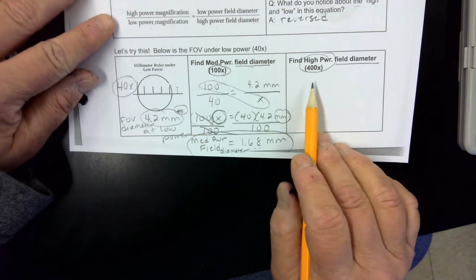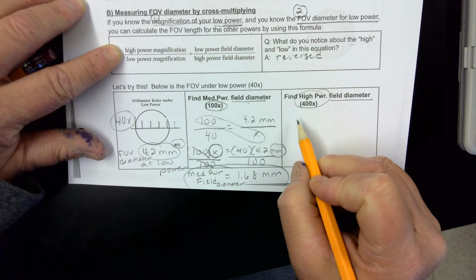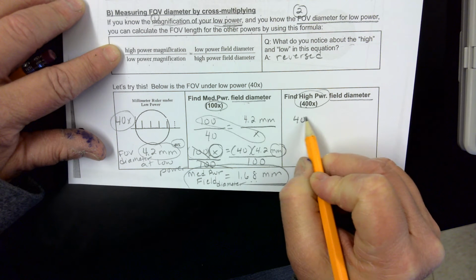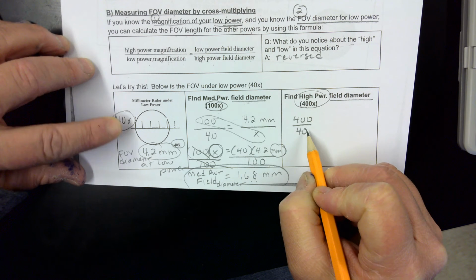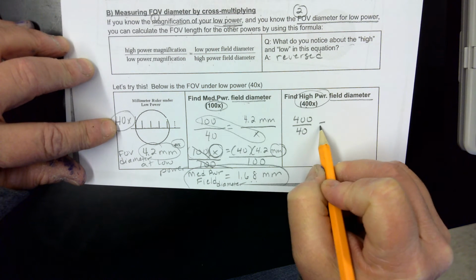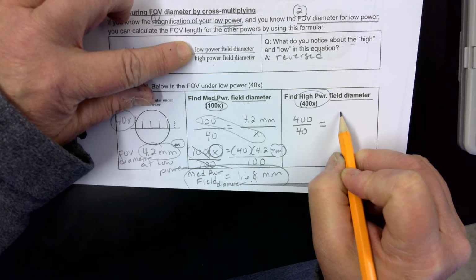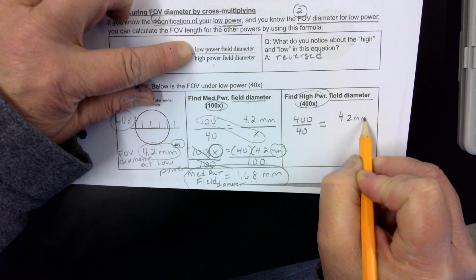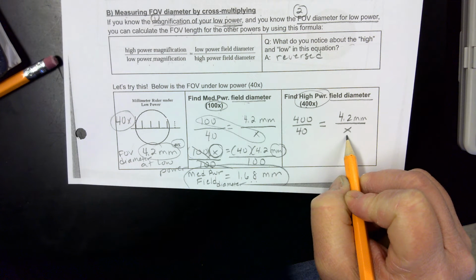Okay? So let's take a look at our equation right here. Our higher power magnification this time is 400. Our low power is still 40, going back to the original. Our low power field diameter is still 4.2 millimeters. It's that high power field diameter that we're trying to figure out.